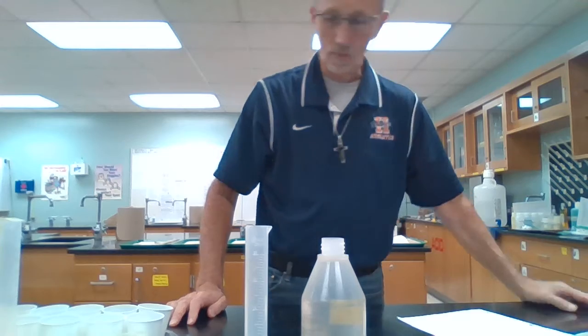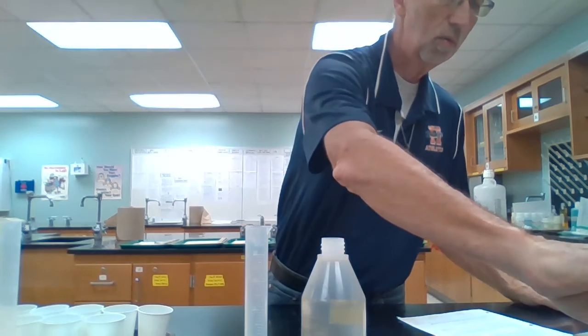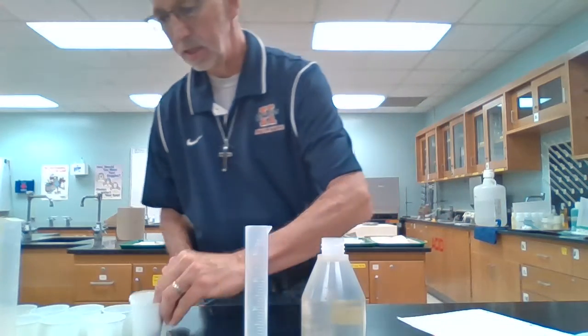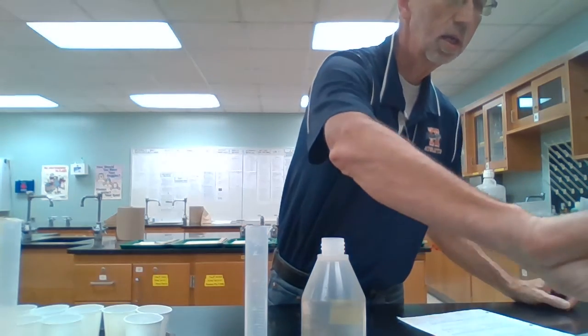Let's now do the zinc ones. So here's zinc sample number 1. Its mass is 31.88 grams. So that's the mass of zinc number 1. Okay. Zinc number 2 is a bunch of little pieces here.